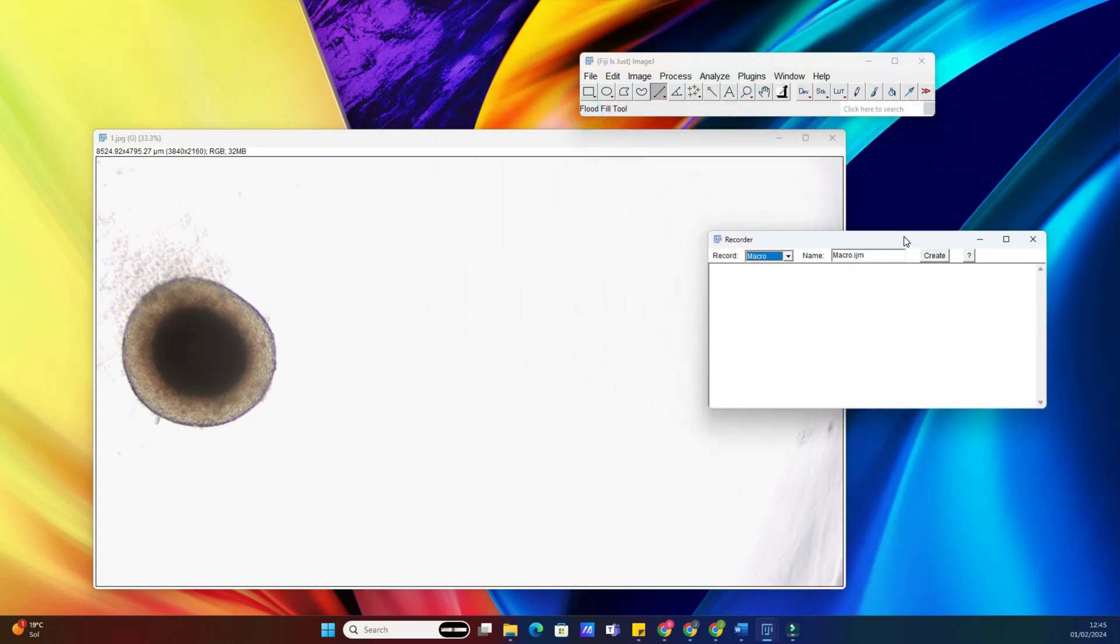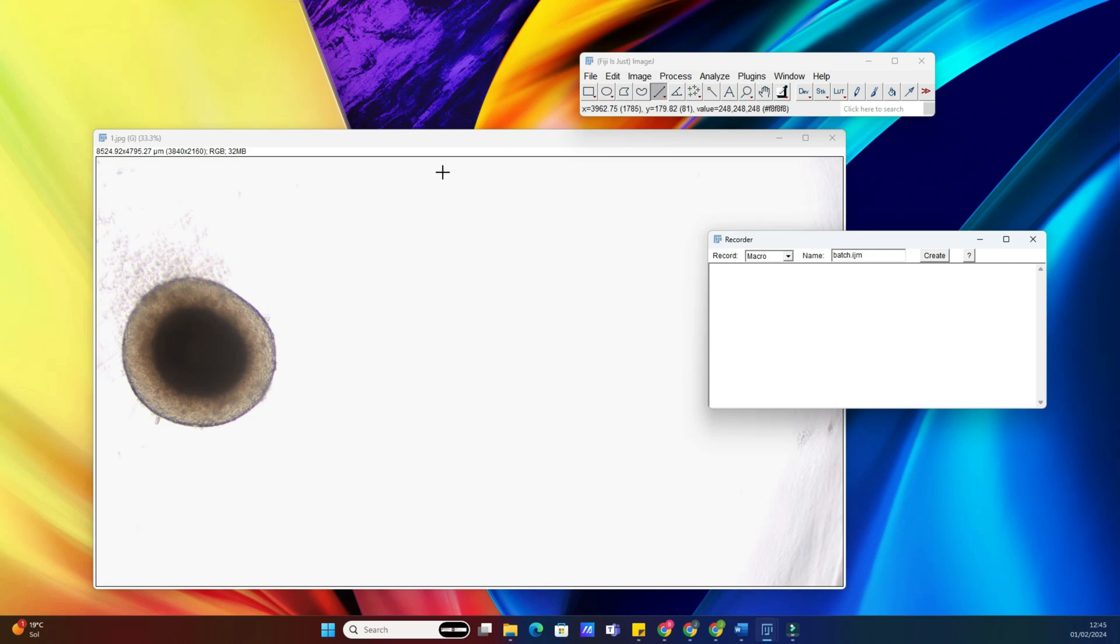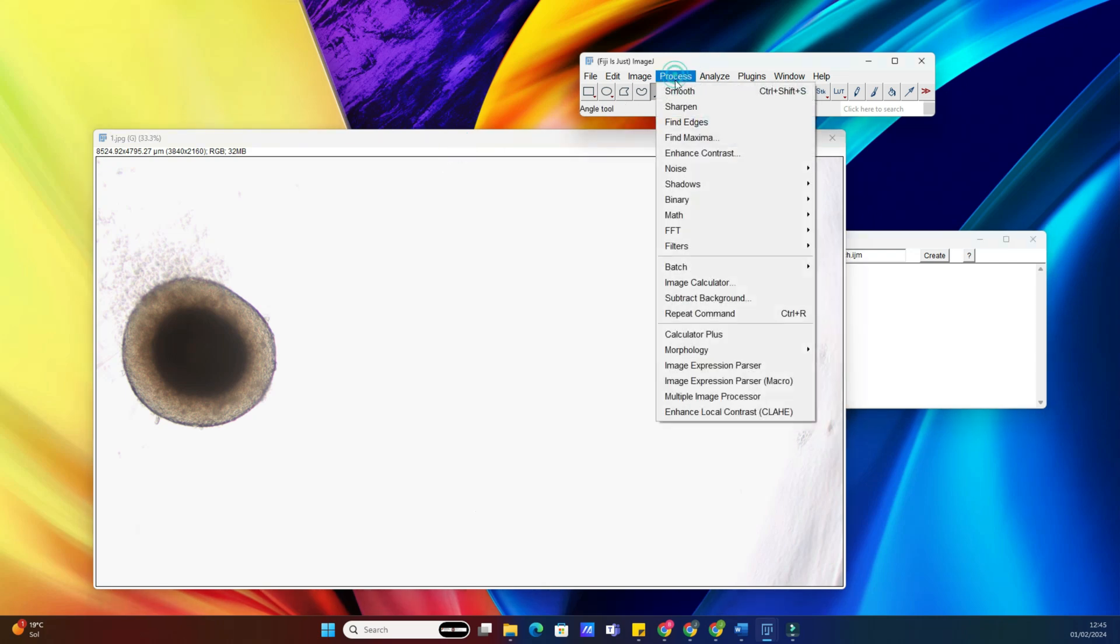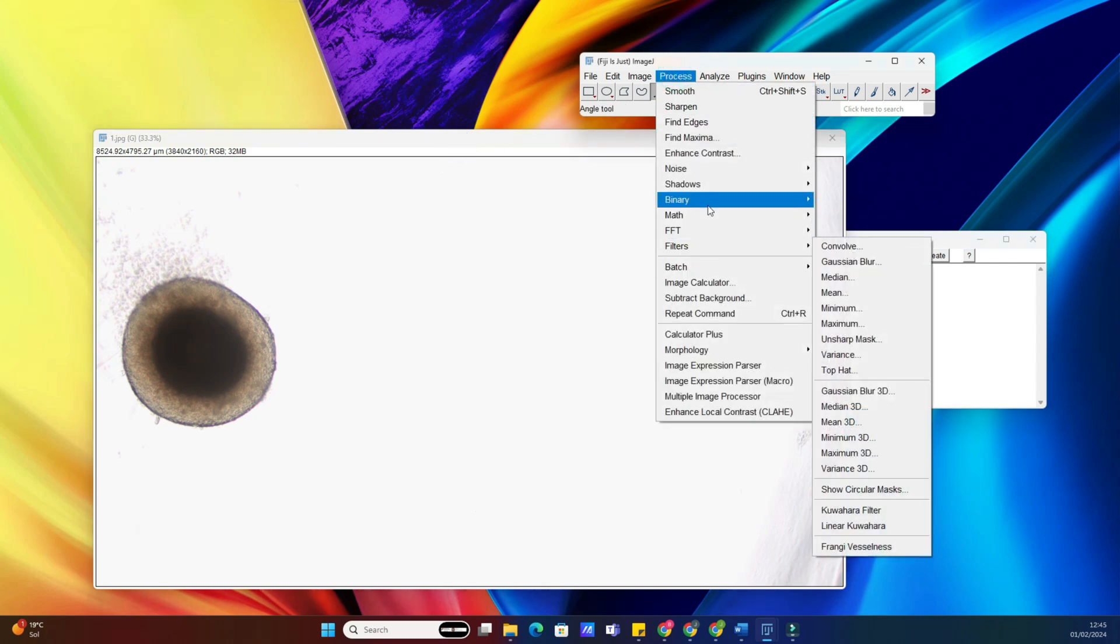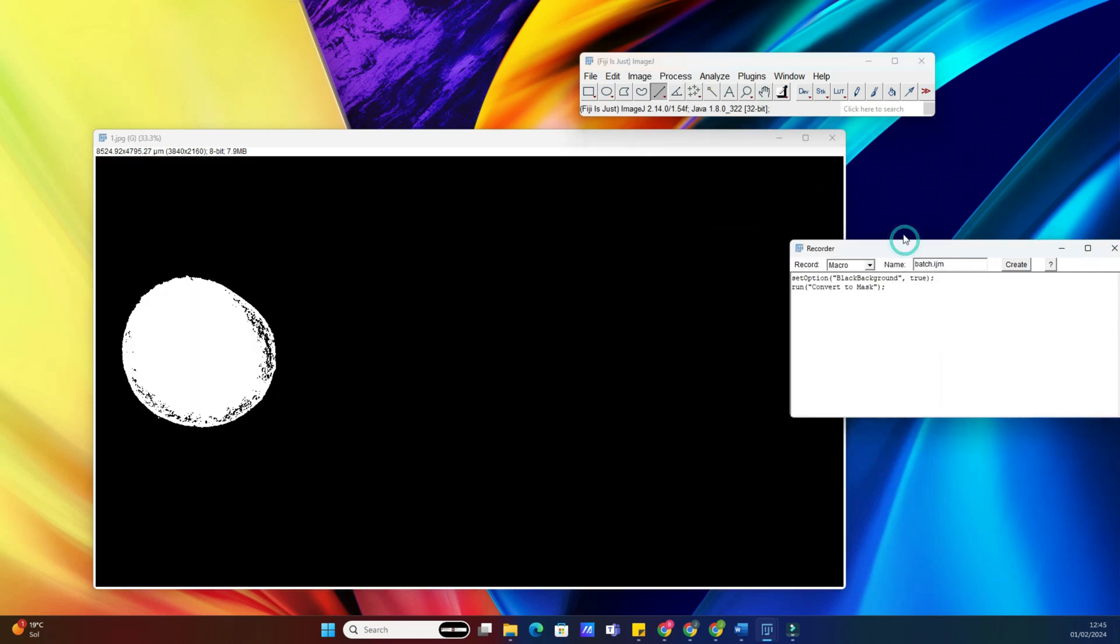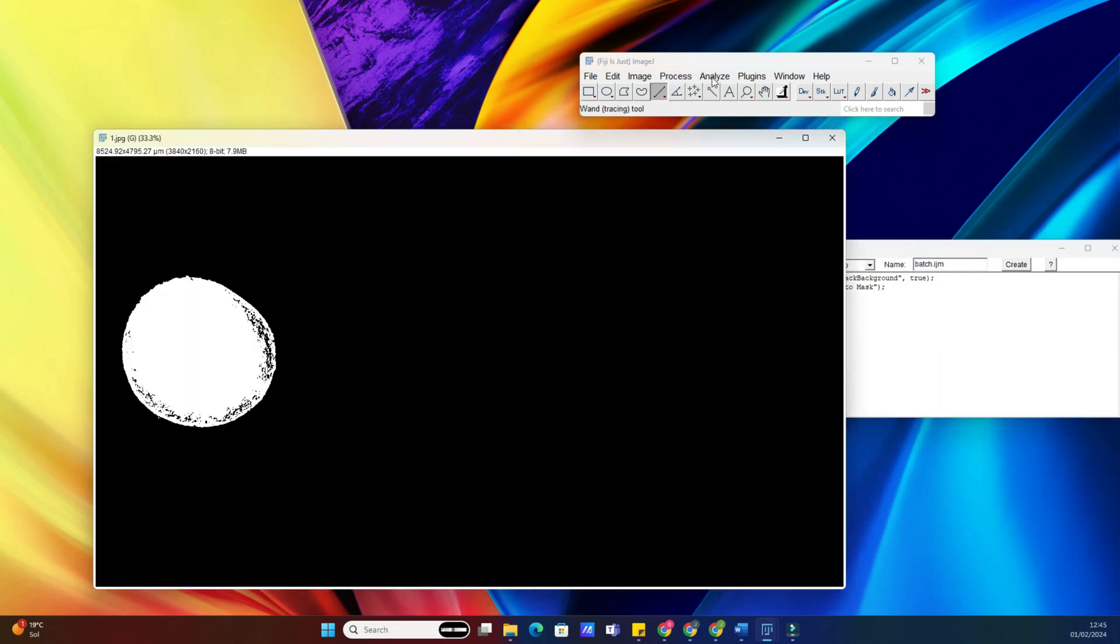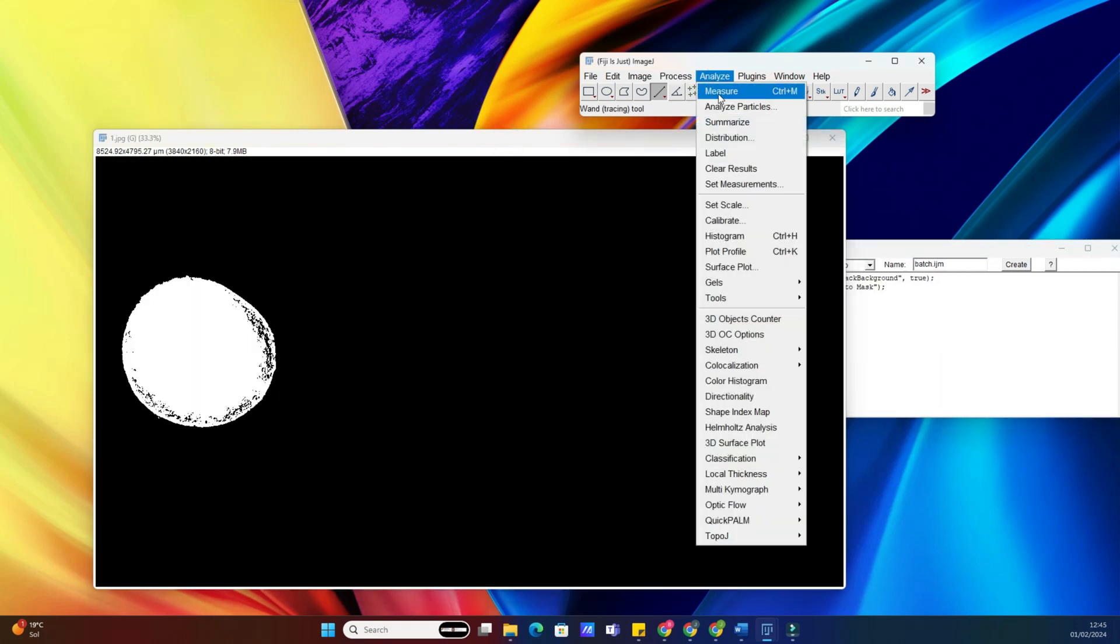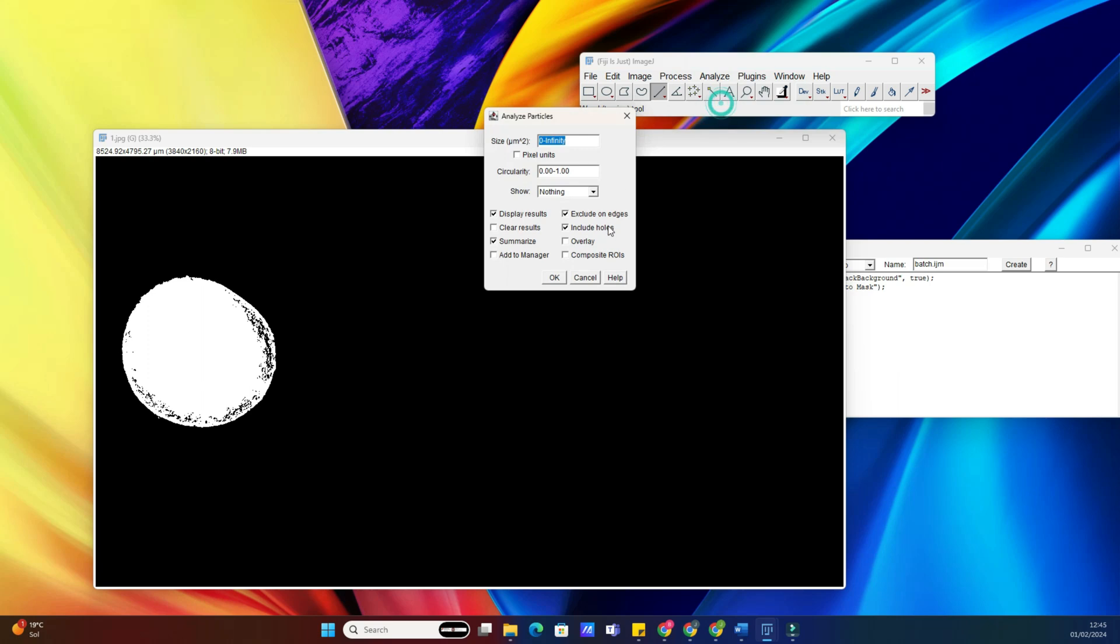Next, we need to record a macro. In this example, we will measure the area of a spheroid. Think of a macro as a series of commands that ImageJ will execute on each image. Go to Plugins, Macros, Record. Now perform the analysis on one image as you normally would, and ImageJ will record the steps.